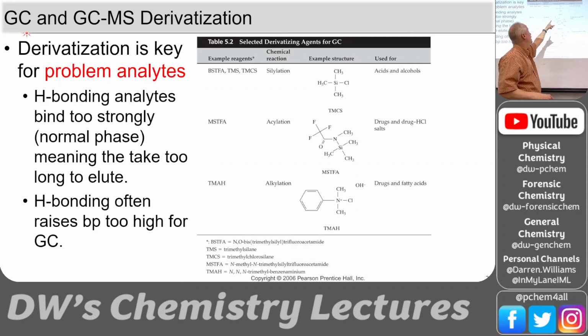The best ones, I think, are those that contain silicon, because you have organic molecules that come out, and then you have this silicon group, and it's going to be unique and easy to track with mass spec, because silicon has a particular isotope pattern. So after you derivatize it with the silicon-containing substances, you're going to have a great thumbprint in the mass spec from silicon.